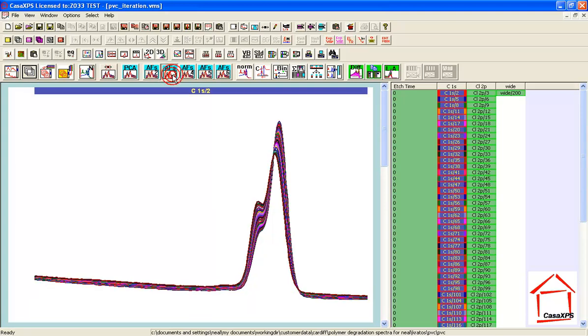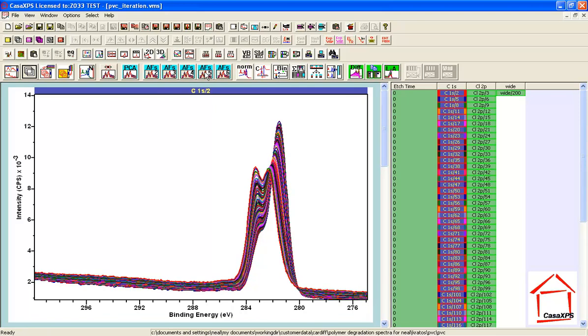If I press the next one, that would be 3, 4, 5, and each one of these is adding a bit more information back into the calculation of these reproduced data. And this is important for eliminating, to some extent, noise from the data without eliminating too much noise. So these are all PCA options. We could have performed all of these using the PCA property page. There's another button here that is equally on the PCA property page, which is reset, so I can return to the raw state of these data.